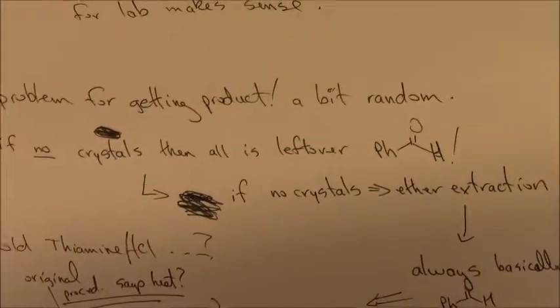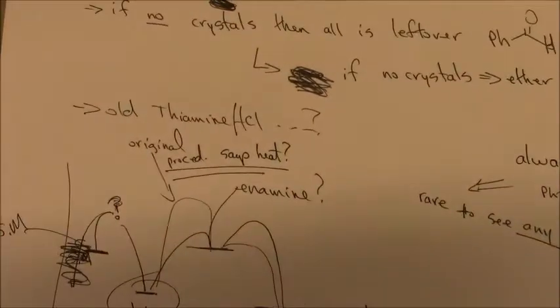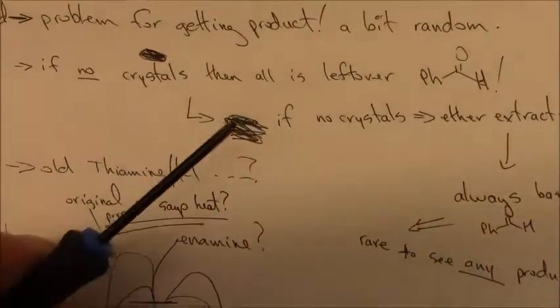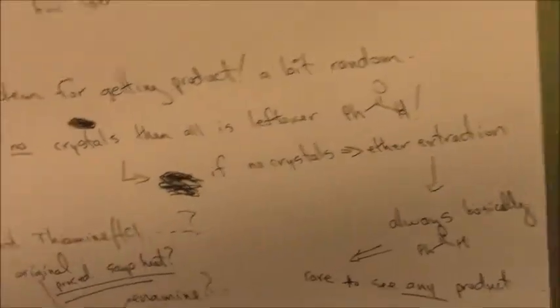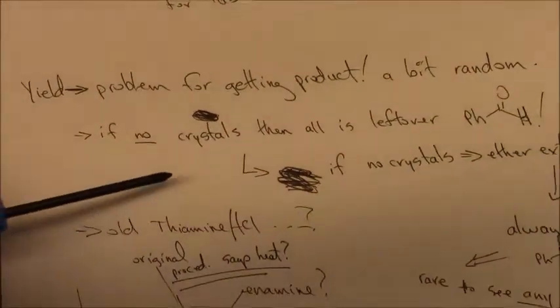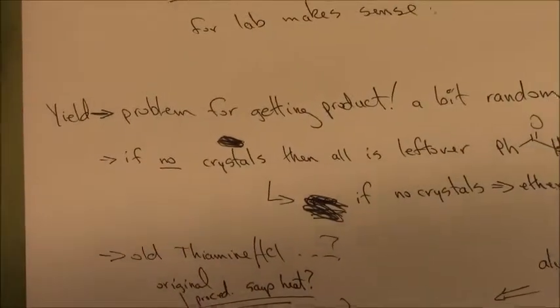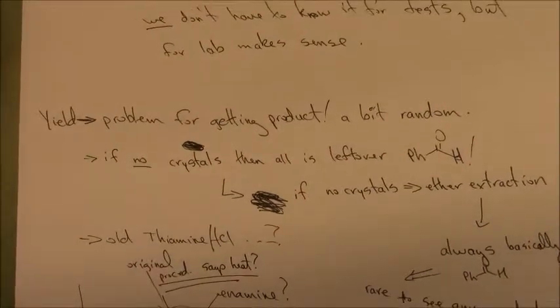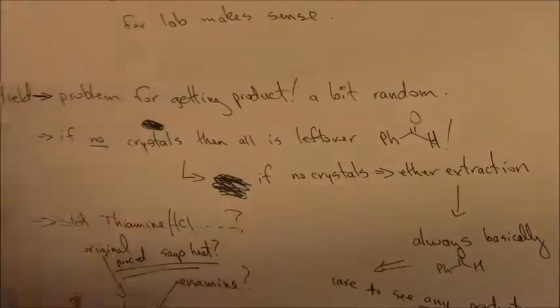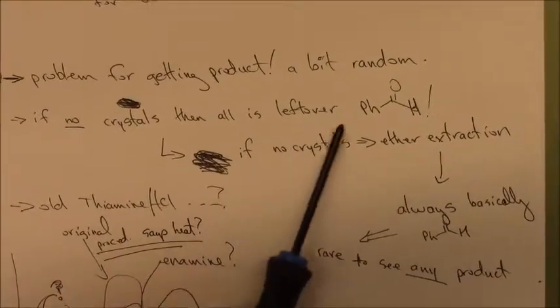Now what they're going to say here is things like, it says in this prep that you should use a brand new bottle of thiamine hydrochloride because they're thinking that it oxidizes. But yet at the same time, we've tried this. We had a TR project where they actually used brand new thiamine hydrochloride and a 4-year-old one, and the last student to use the procedure we're using now found basically no real difference.